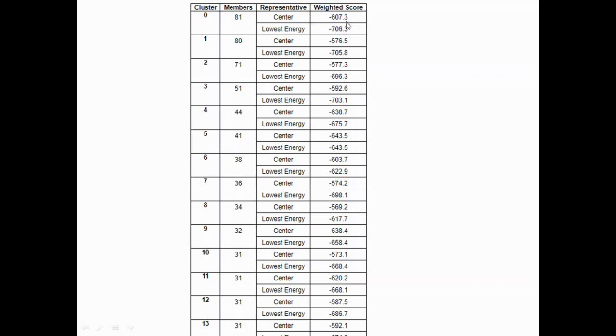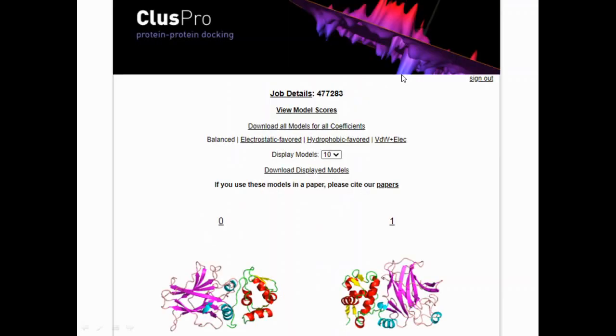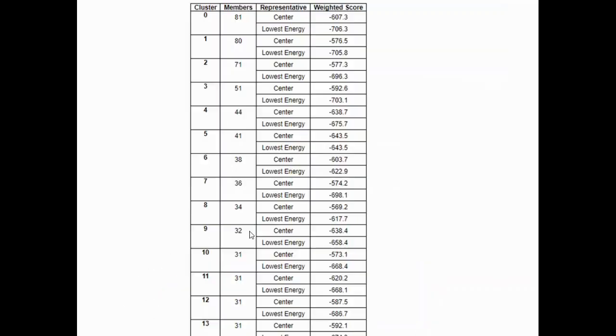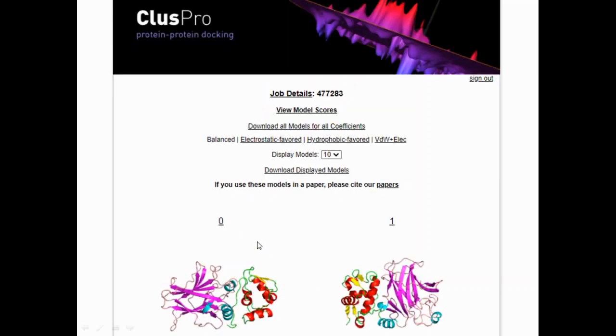The lowest energy here is minus 706.3. Then your next cluster model gives the second pose at 705, the third pose gives 696, the next pose gives 703. Of this, the best pose here is your first, the 0th pose, which gives us a docking score of minus 706.3. What you can do is download your displayed models here, and you can download the 0th pose, which gives us minus 706, which is your best pose. This can be considered as the best protein-protein docking score.